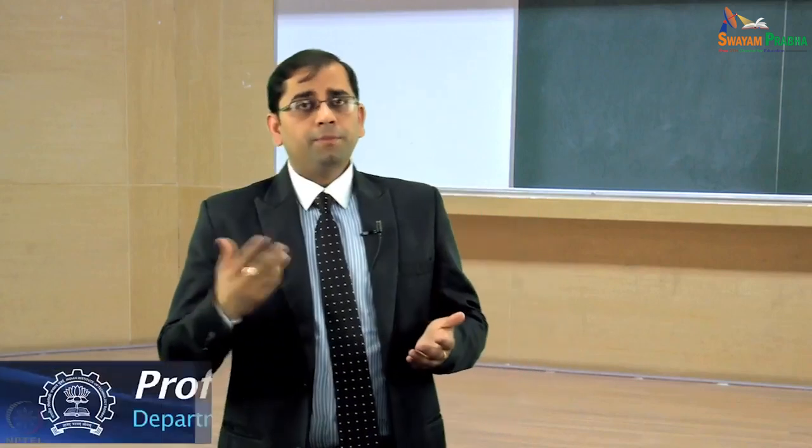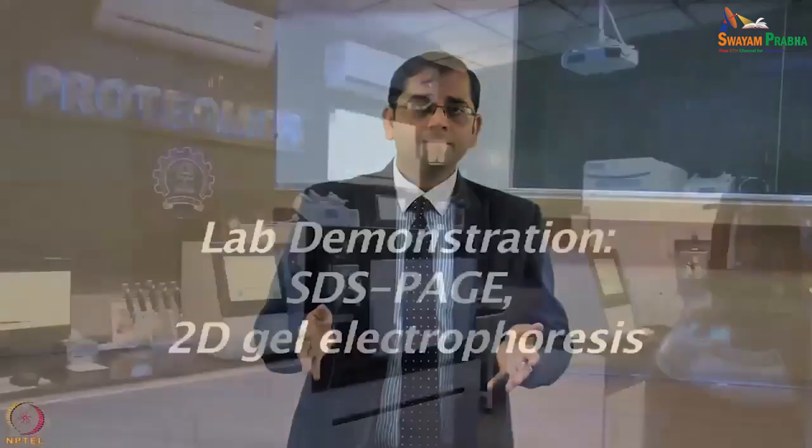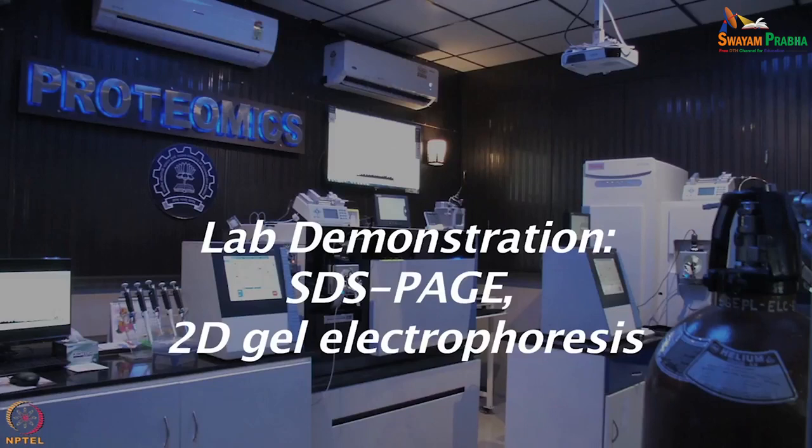So then, as a part of 2D electrophoresis, I also tried to brief you about the SDS-PAGE gels, which separate proteins on the molecular weight basis. So by now you have a good concept of how two-dimensional electrophoresis can be performed.